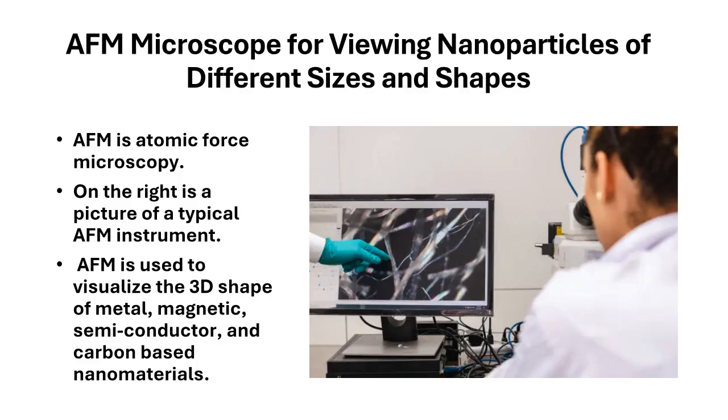For AFM measurement, substrates such as gold on glass, or other types of substrates are used. There are 3 modes for AFM: contact mode, non-contact mode, and tapping mode, which is also known as intermittent contact mode. It can be used to image a wide variety of materials such as DNA, proteins, and nanoparticles. However, TEM and SEM are much more popular tools to use for characterization of nanoparticles.